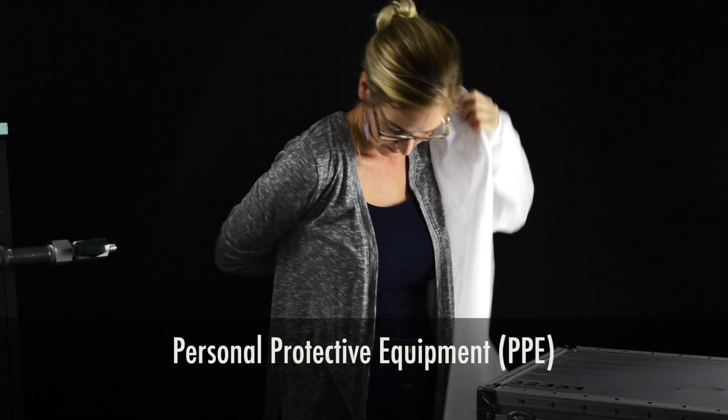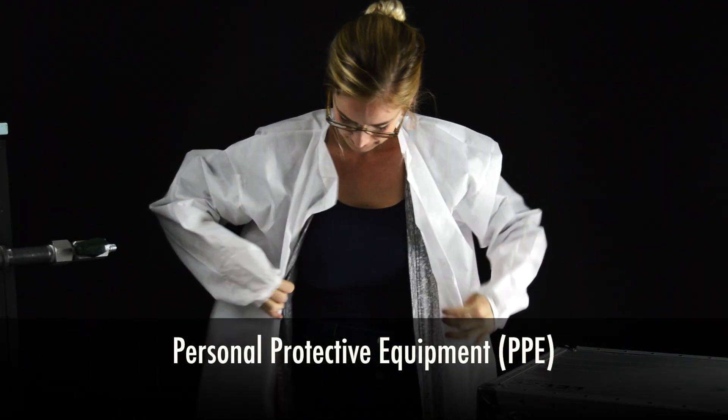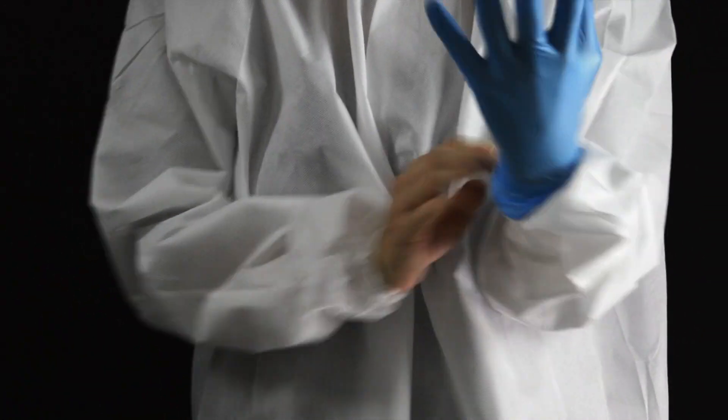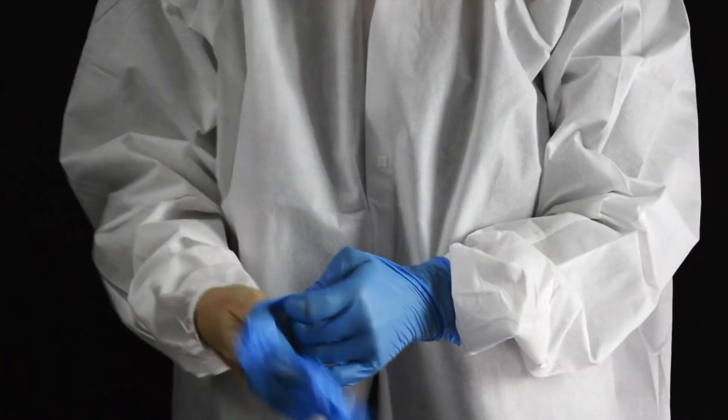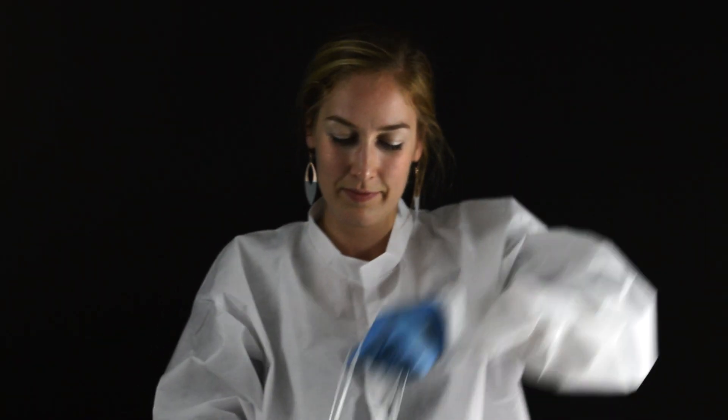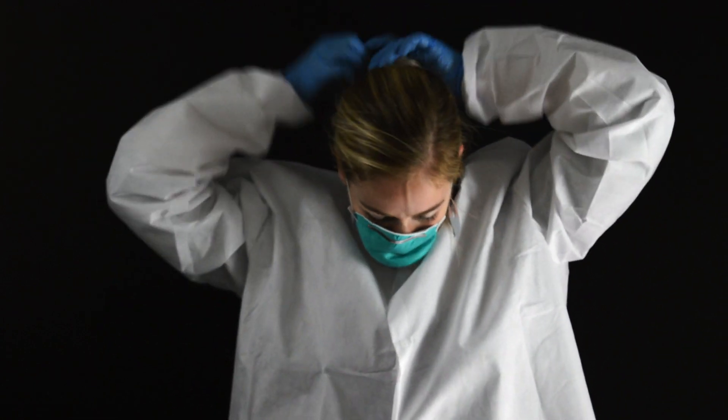Put on your personal protective equipment, also known as PPE. You'll need a clean lab coat, sterile gloves, a protective face mask, a hair net, and safety goggles or glasses. PPE is a critical part of aseptic technique that should always be included in your sampling plan.